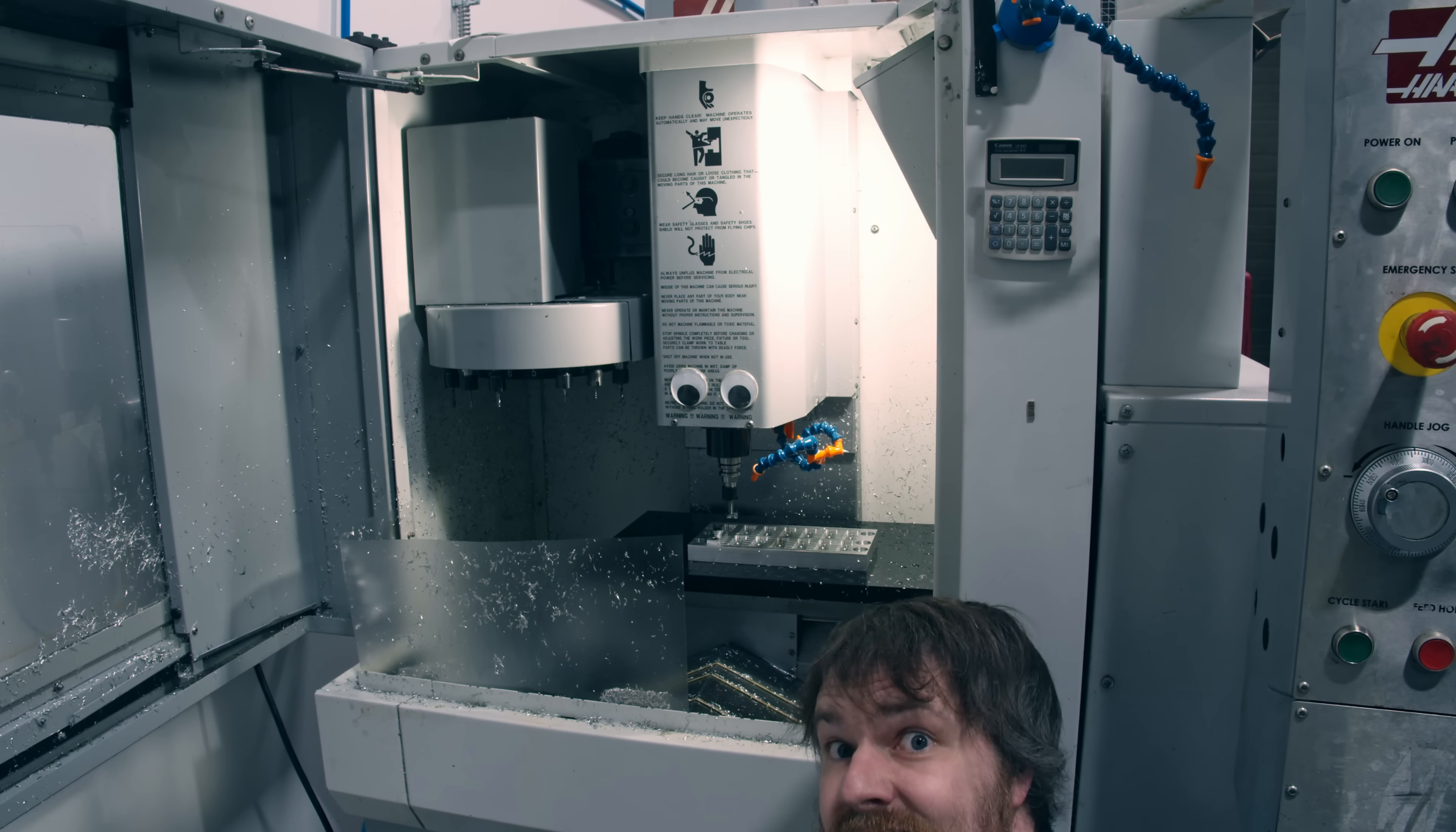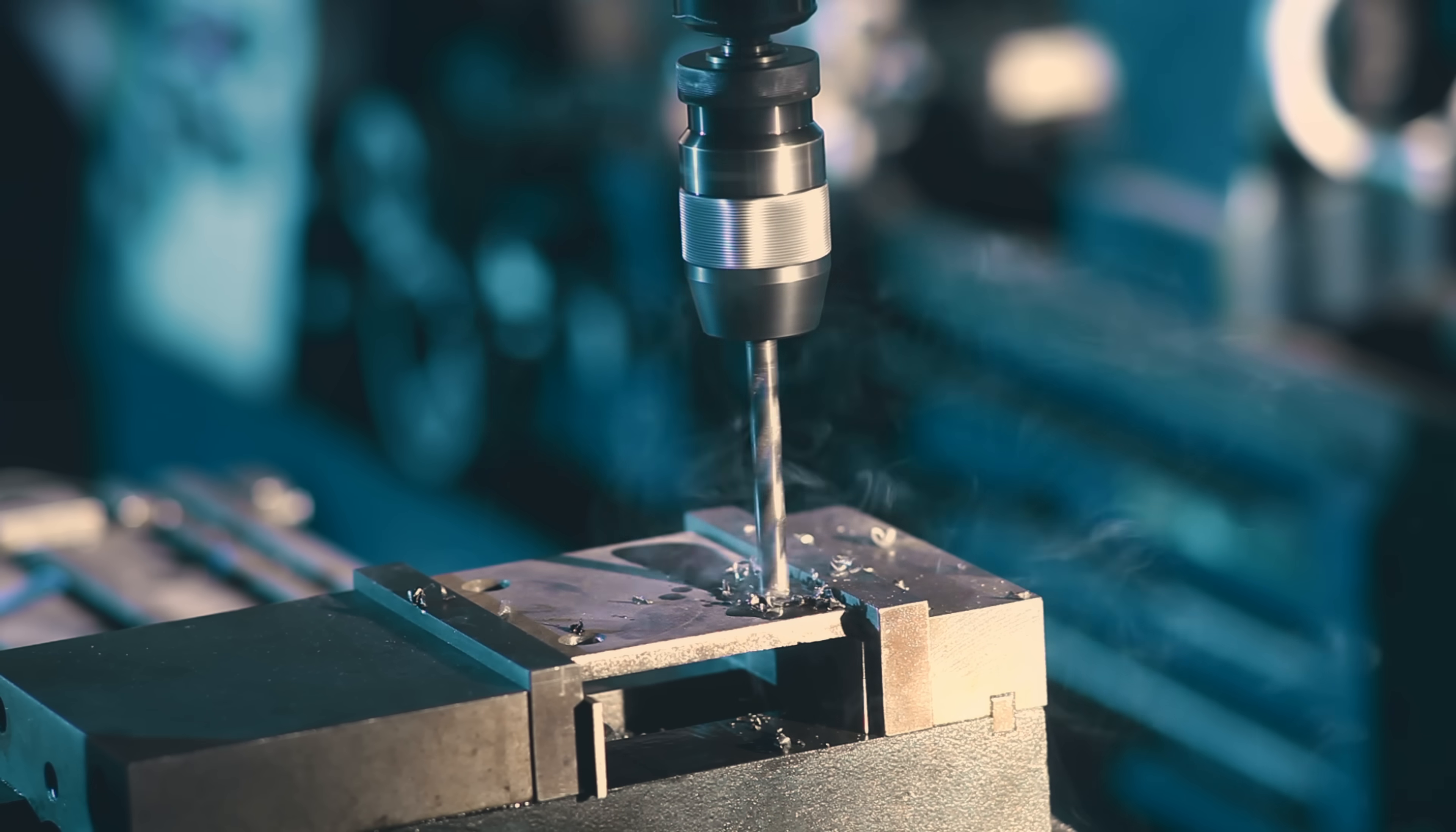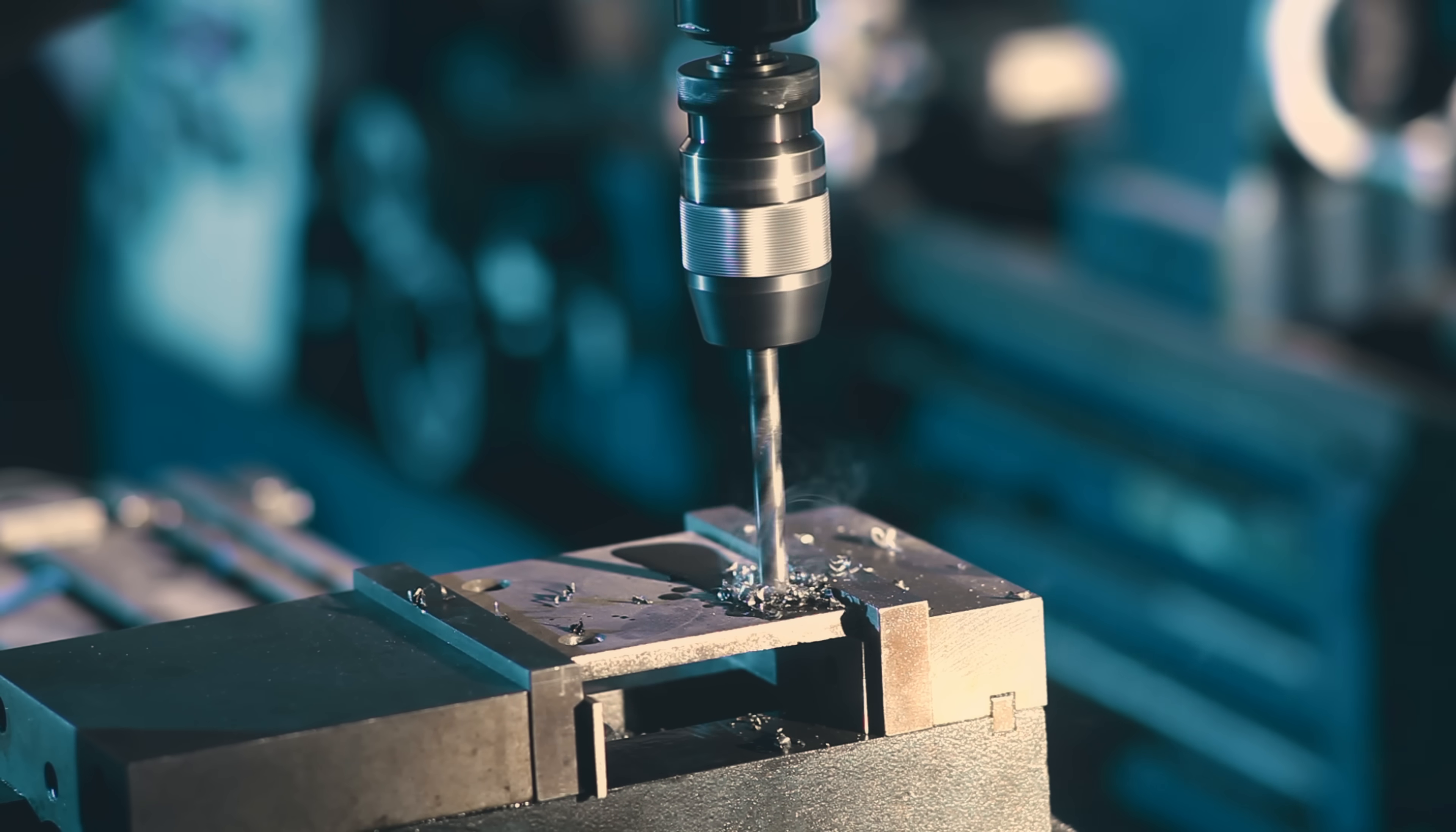So let's back up and talk about what's going on here. There are a lot of different ways to cut metal. Small milling machines, fancy 5-axis CNCs, or even a drill press and hacksaw. Fundamentally, the principle is very simple. You take something that is harder than the metal, add a sharp edge to it, and then push it through the metal. If everything goes well, you just cut some metal. Congrats!